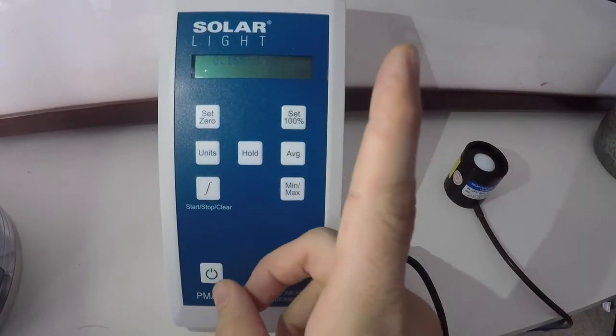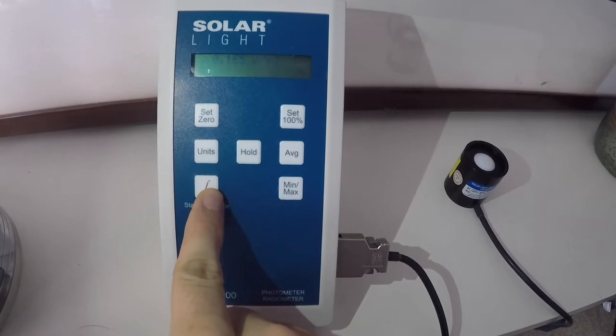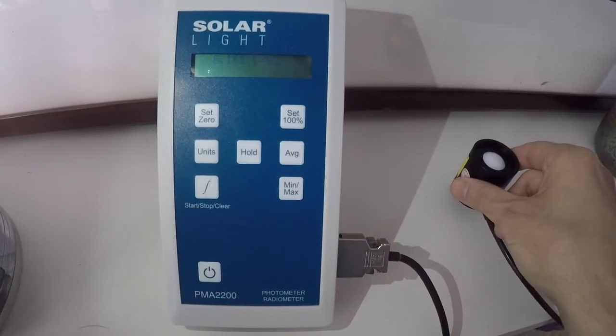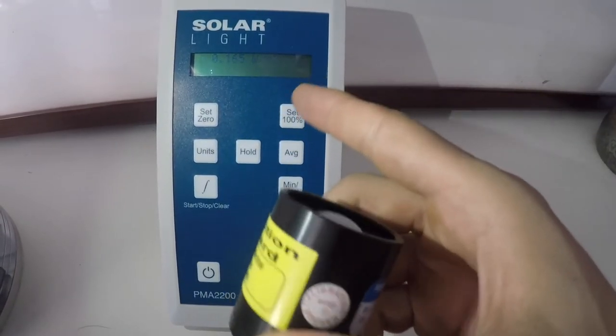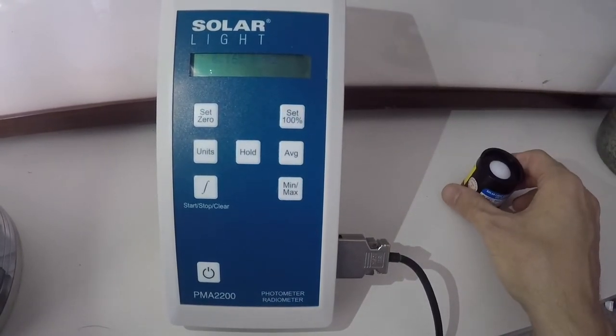This is also handy when you do the Dose feature. Because if I have my sensor under a light source, I can hit Hold and then move the sensor away, and this will keep counting my dose even though I can be across the room.